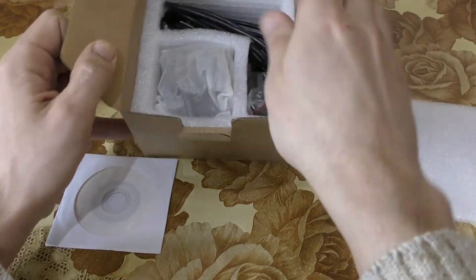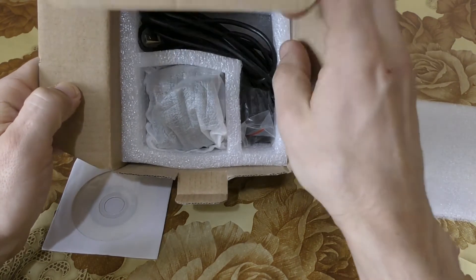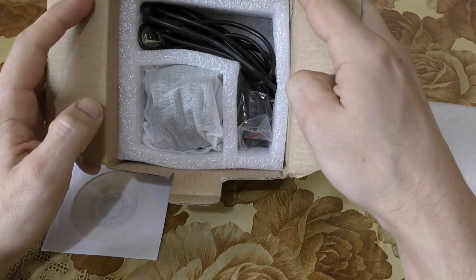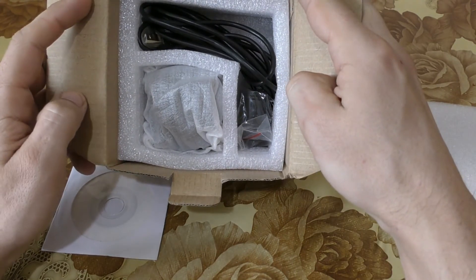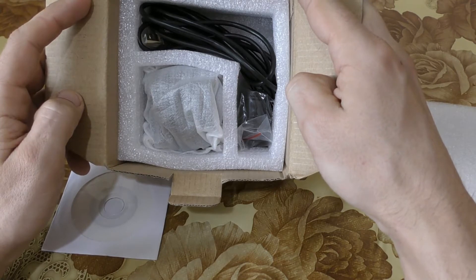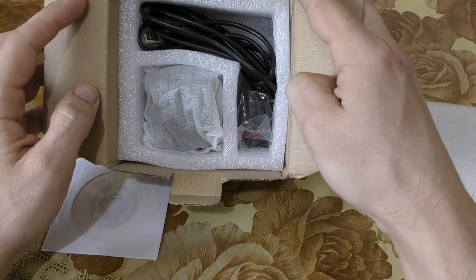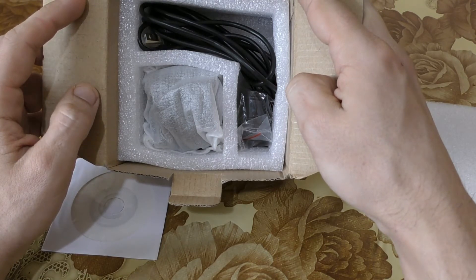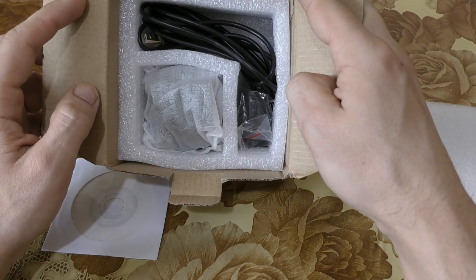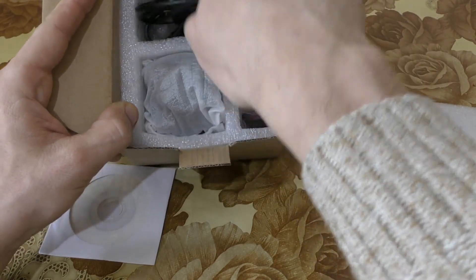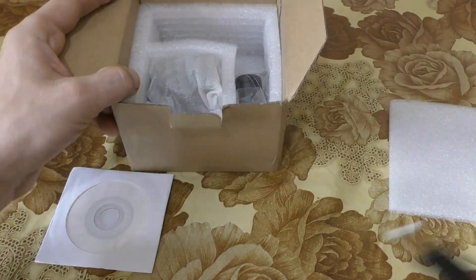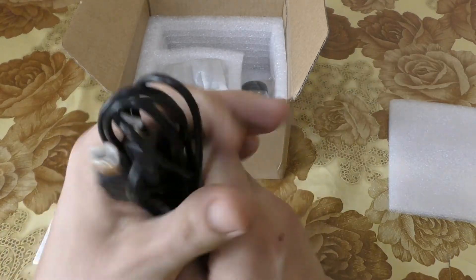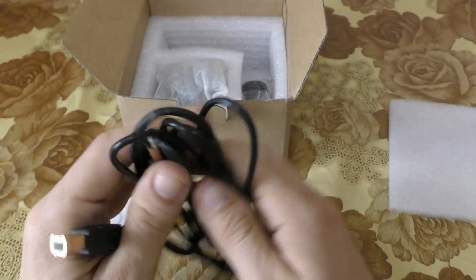Let's take off the cover and look inside. We have a cable, we have a shortcut for mounting our camera into the optical device, and the camera itself. Let's take out the cable - this is a standard cable.